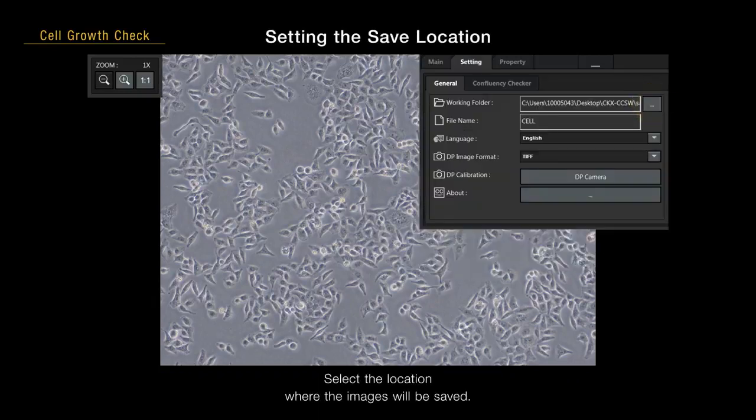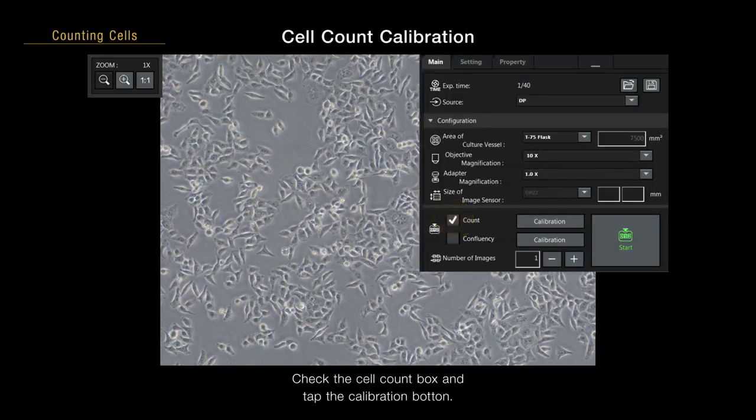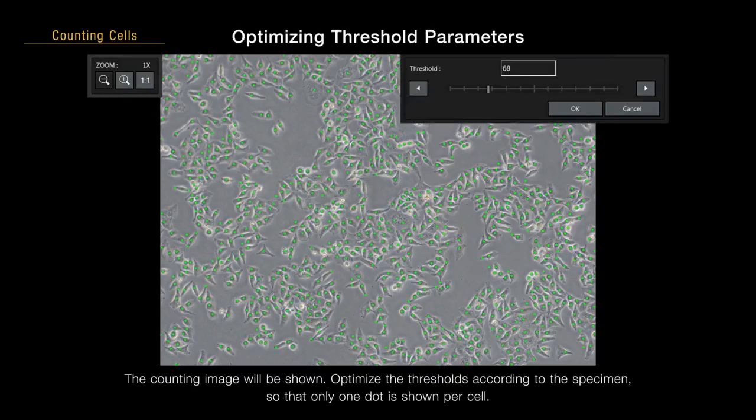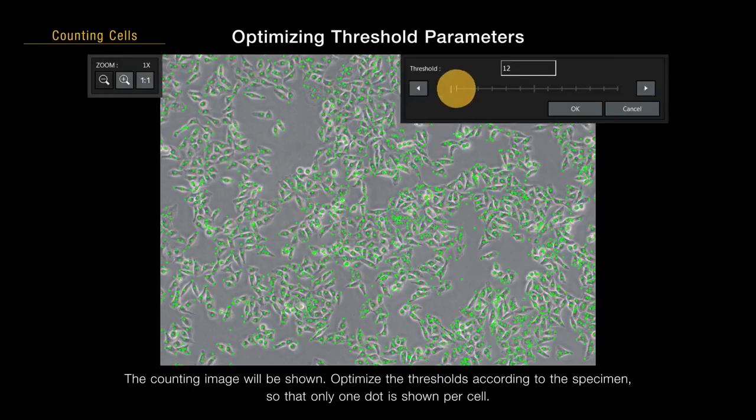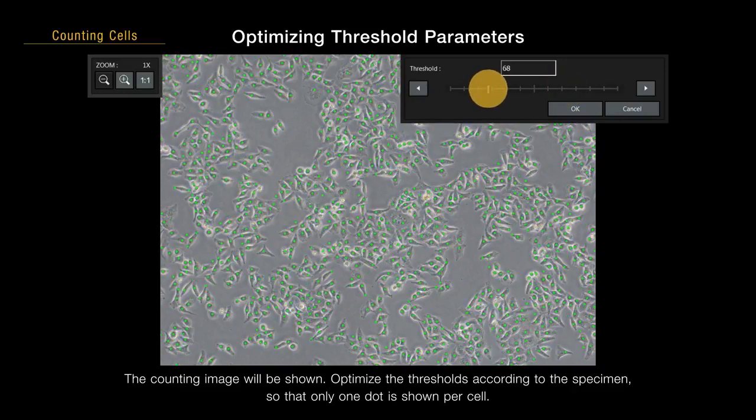Select the location where the images will be saved. Check the cell count box and tap the calibration button. The counting image will be shown. Optimize the thresholds according to the specimen so that only one dot is shown per cell.